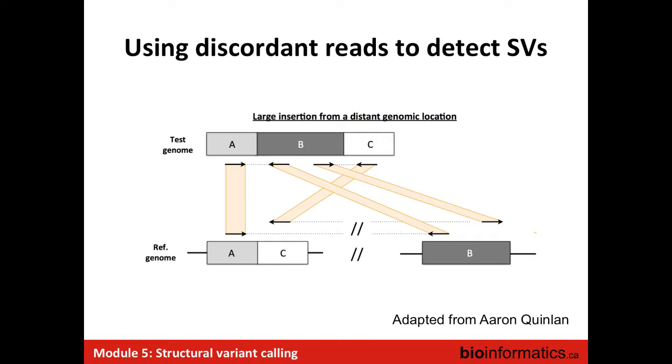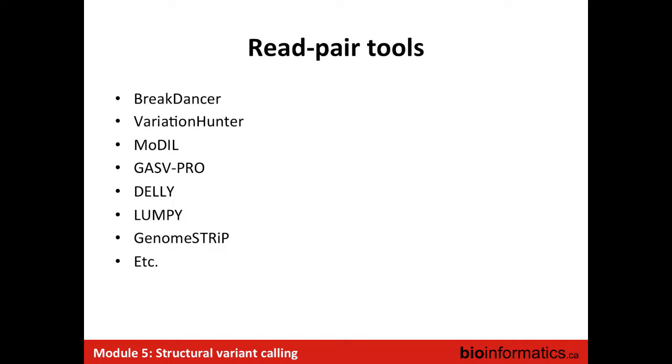It is really simple, but with the limitation of the size of the read and the standard deviation of the size selection. There are many tools to do it, like Breakdancer, one of the first tools that was released, and a lot of other tools. Today we will use Delly to do that, which is a really great tool. You will understand why after that.